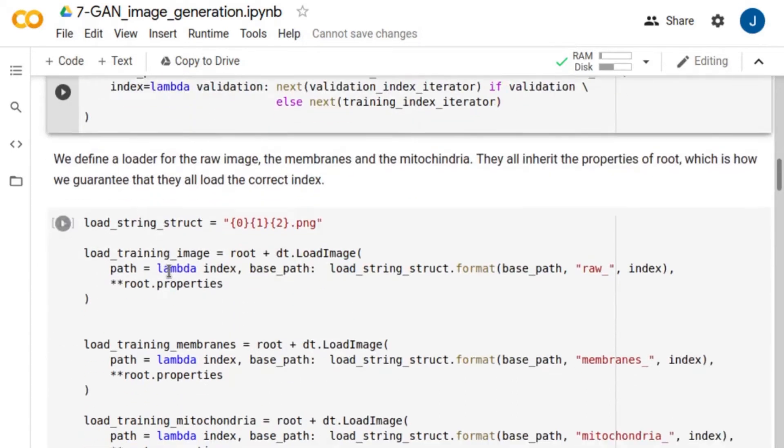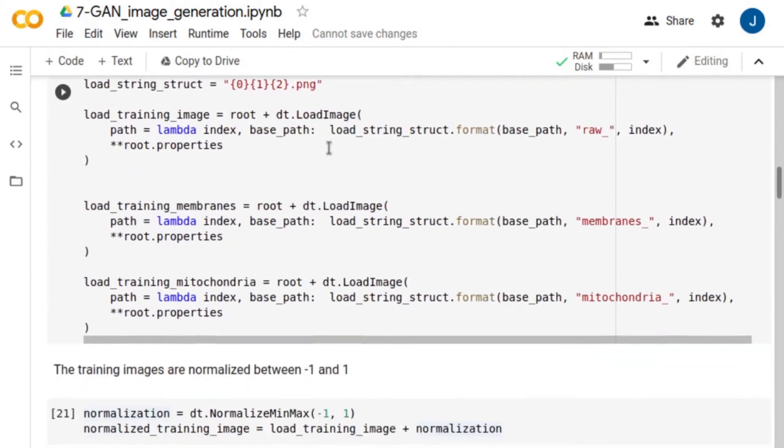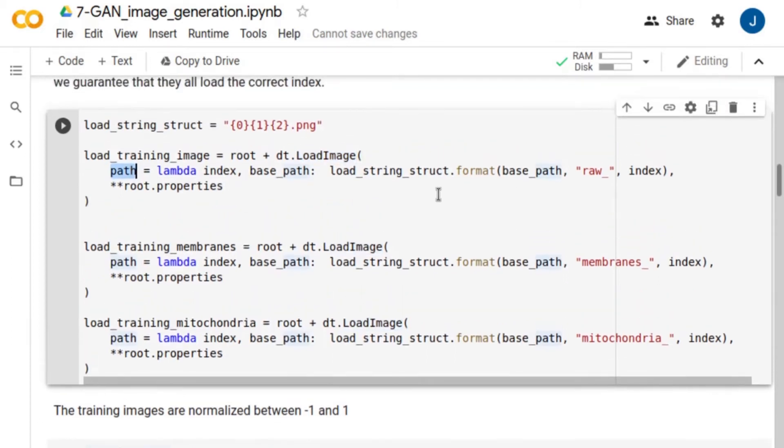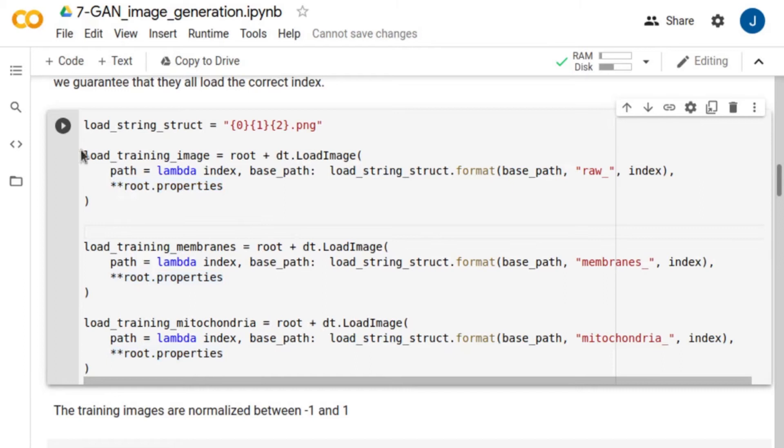To read the images we use the load image feature. The input to this function is the path to the image to load. We want to read all the images, the raw cell images, the membrane images and the mitochondria images with exactly the same index. To do so, load image inherits the properties of root, which contains the base path as well as the index file.